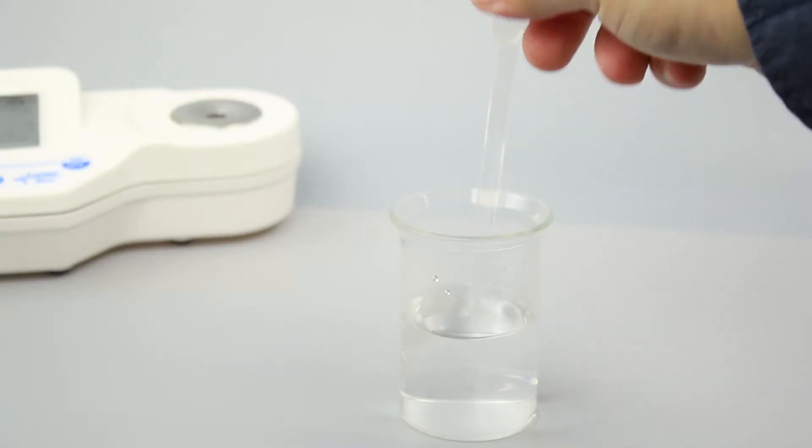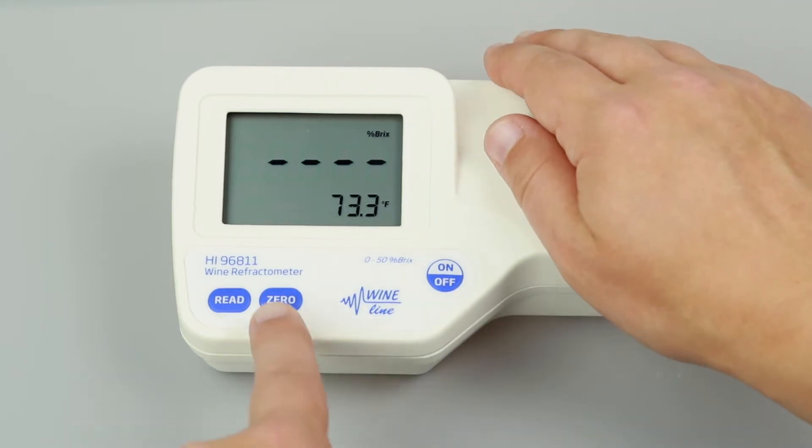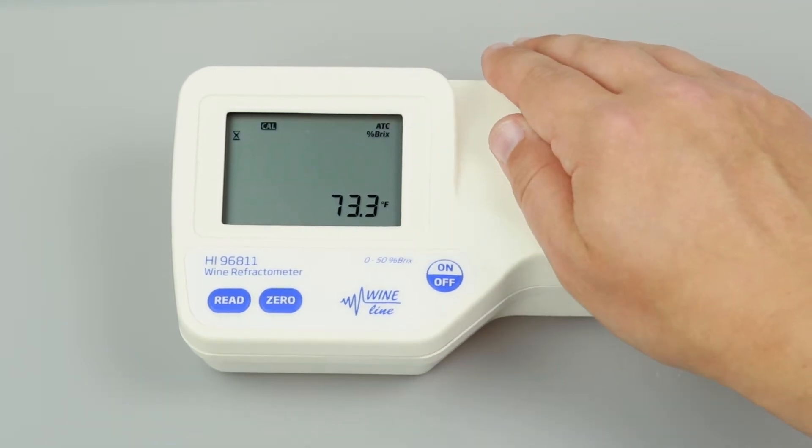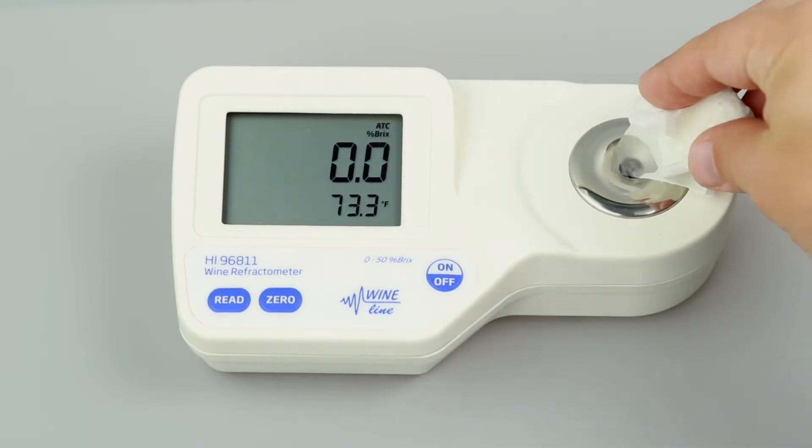Calibration is essential for refractometer operation and takes just a few seconds. We recommend calibrating before each use. To calibrate your refractometer, fill a plastic pipette with deionized water and cover the sample prism with just a few drops. If there's a strong light source nearby, cover the prism with your hand. Press the 0 button. Once 0 appears on the screen, use a soft tissue to absorb the deionized water off the prism.